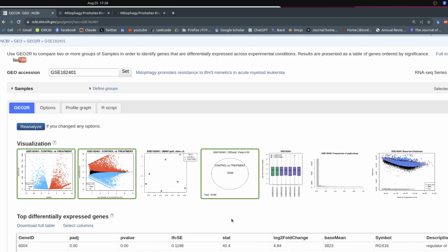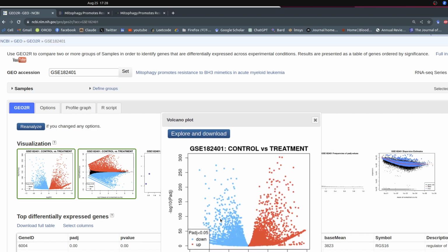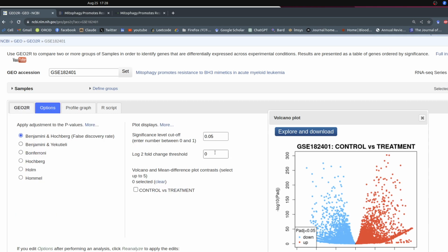So the next part of our analysis is to identify the genes that are differentially expressed. When you do the control versus treatment comparison, you see almost all genes are down-regulated and up-regulated, which is not true. So based on this, we need to do some optimization in the analysis pipeline. We get back in here and we set up the log fold change accordingly. So we have this figure. We see, okay, probably most of the genes are like these, so let's select the log fold change. Okay, 8.